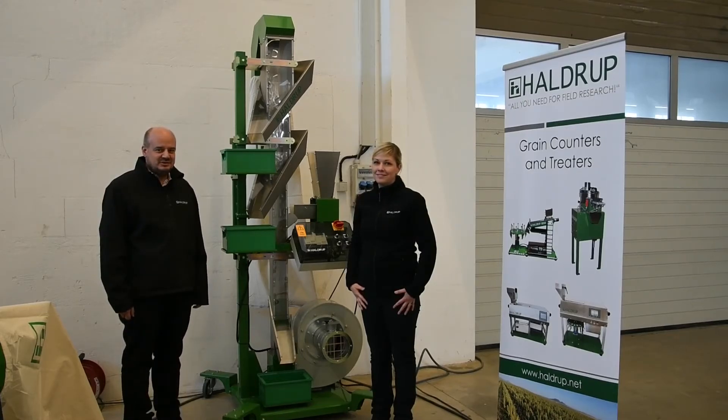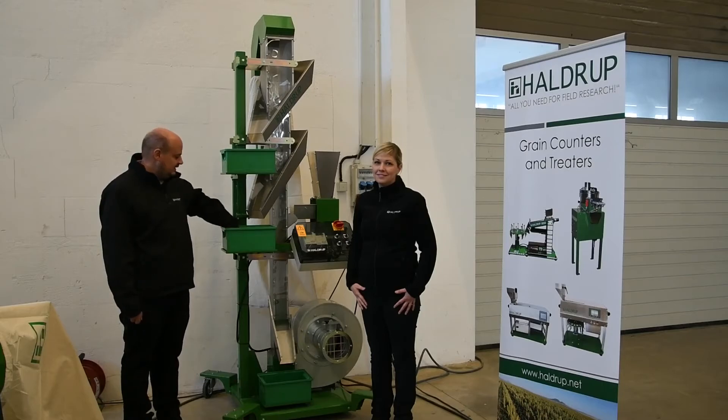Now we will demonstrate these machines with the cleaning of corn samples.